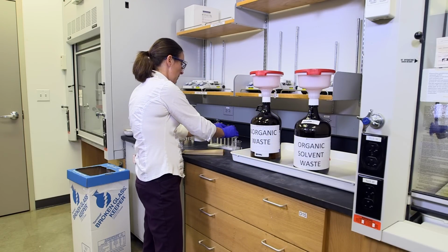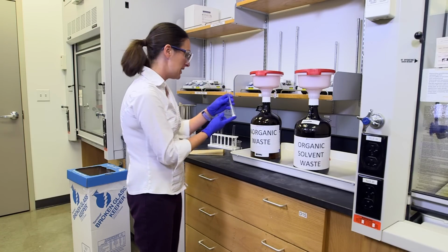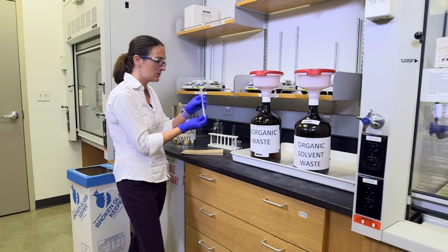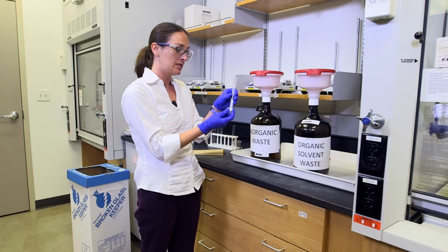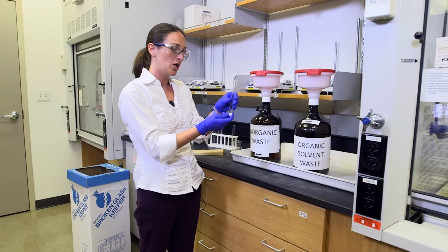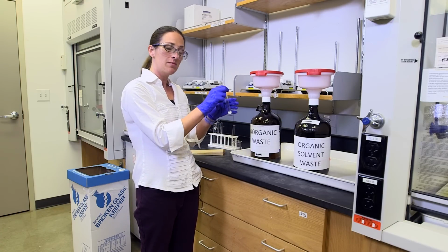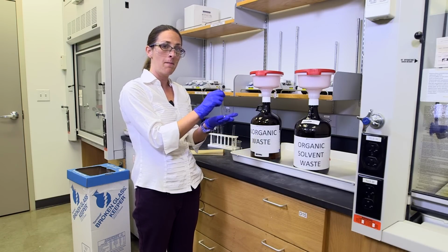Now sometimes you still have remaining solid left, and if you can't scrape it into this, what you need to do, for this particular experiment, when I was using my temperature probe and generating cooling curves, is go back to my hot water bath and put this back in there until it has become molten.